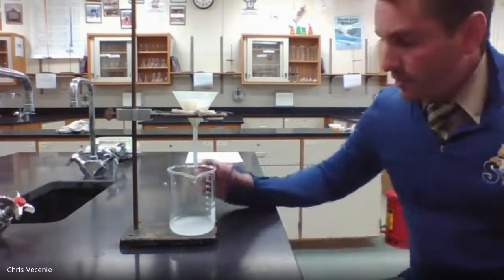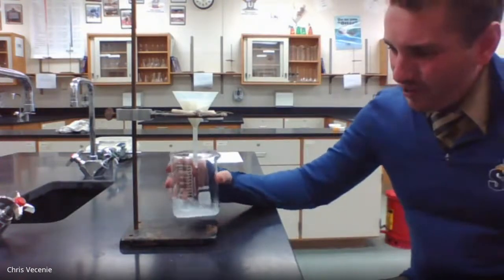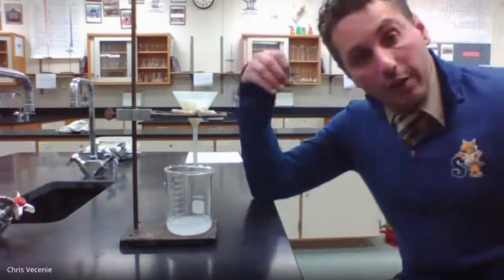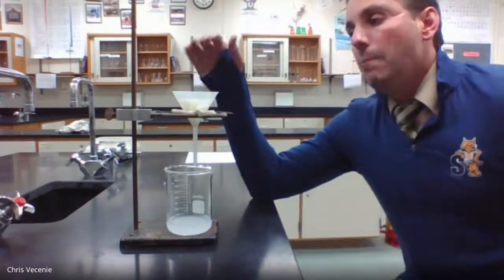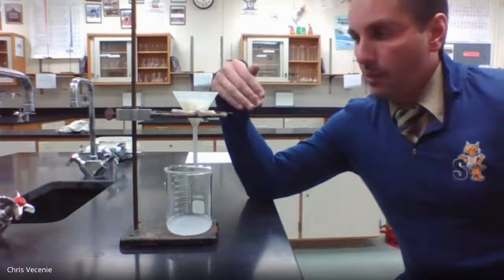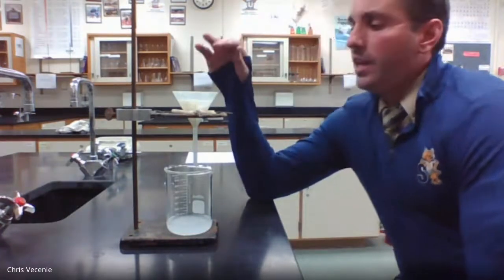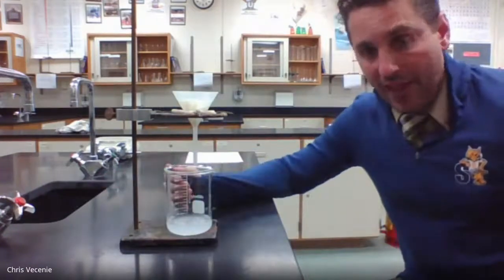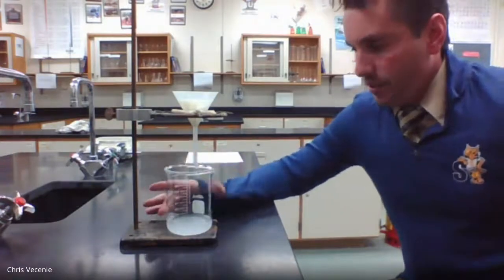A couple things to note. The reason this takes so long, if I look underneath here, it looks like that is not perfectly clear. It looks like a little bit of the solid has made it around my filter paper. Sometimes it's due to overfilling. Sometimes it's due to the filter paper having wide pores or something like that. Sometimes you just flat out miss, okay? And it just makes it through here.